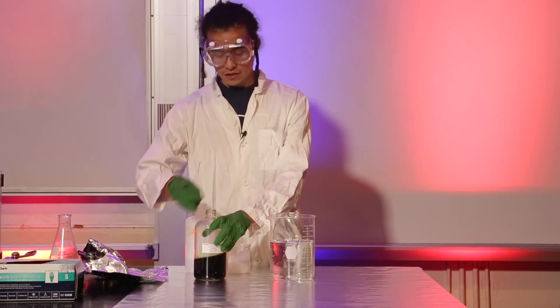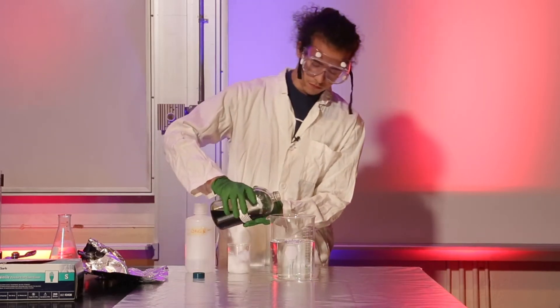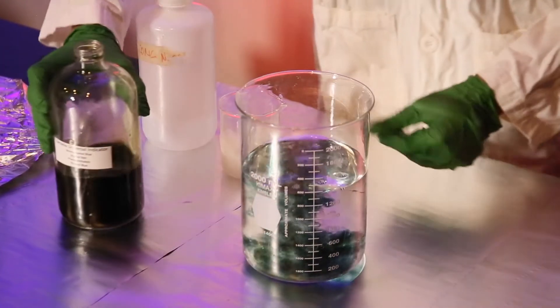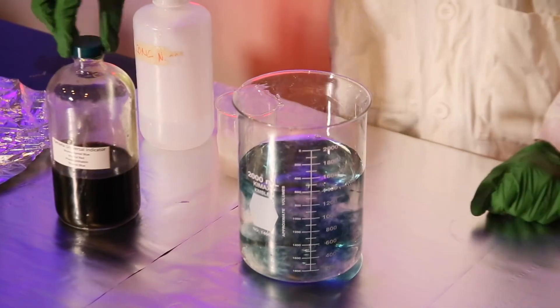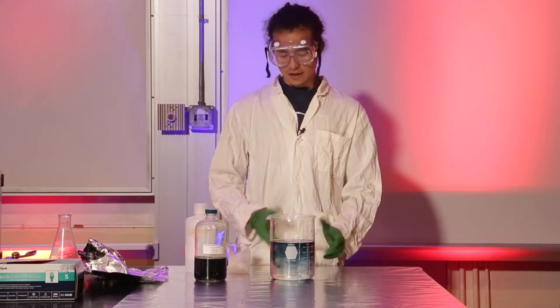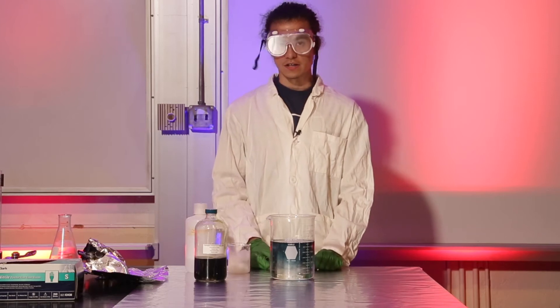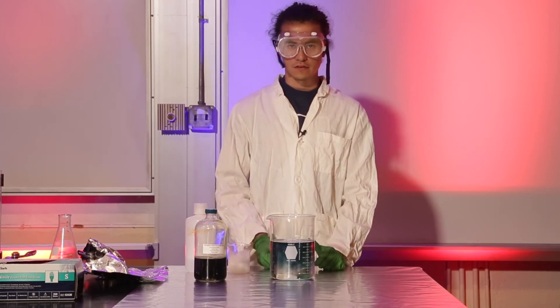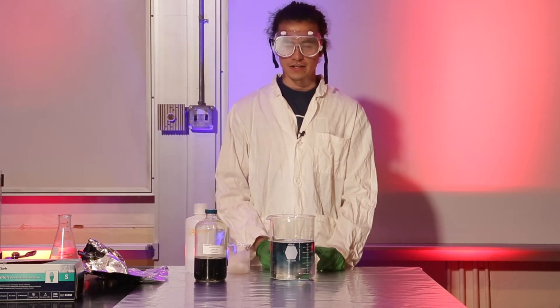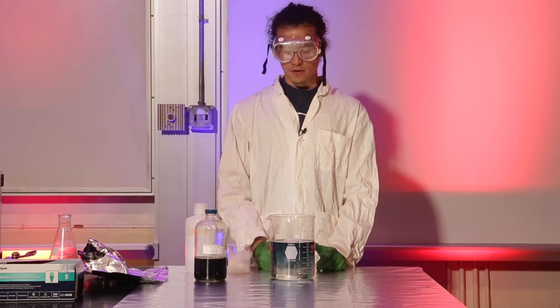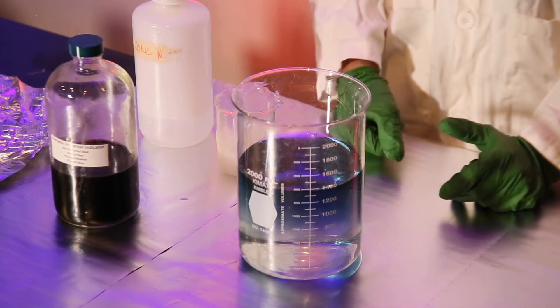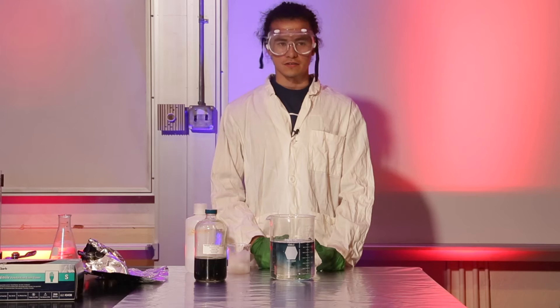So pH is just a measure of acidity. In this case with this indicator, the more yellow it is, the more acidic it is, so think like lemons, very acidic. And the more blue or purple, the more basic, so think like soap.